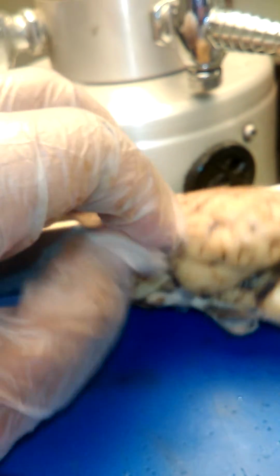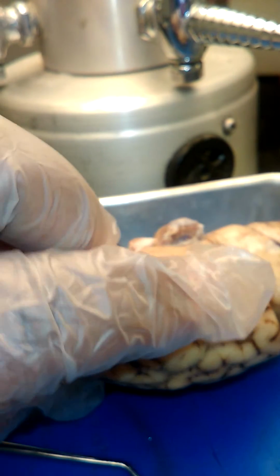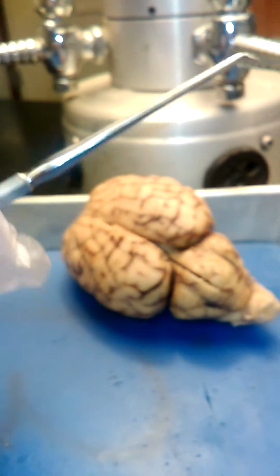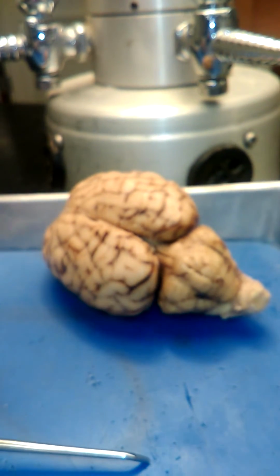This is the temporal lobe, and there's one on each side, of course, of this sheep brain. Here's the other one. Okay? And then in the back of it, we have the cerebellum of the brain. Okay? So let's turn this brain over, and we're going to look at some nerves.